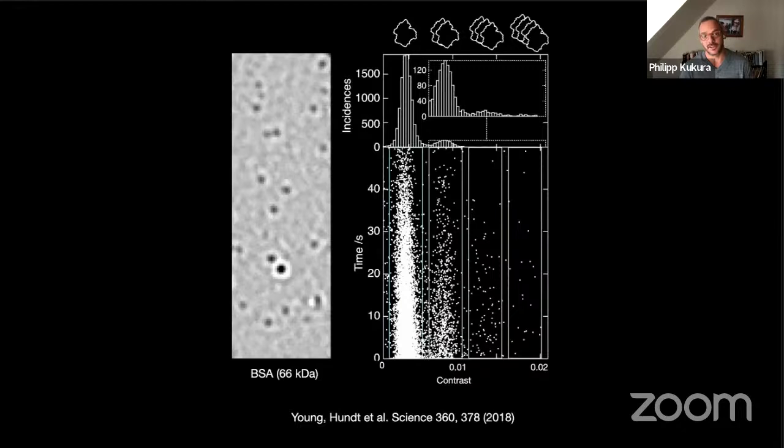Yeah. Again, if you compare the ability to size individual particles here compared to something like using a TEM and drawing lines around particles, this is a lot more high throughput. You could do it in situ. There's lots and lots of things you could play with, and I think there's lots of potential there. It just so happens that I collaborate with biologists, and I'm surrounded by biologists, so that's what we've been using. But I'm totally with you that the synthetic universe is one that needs exploration.